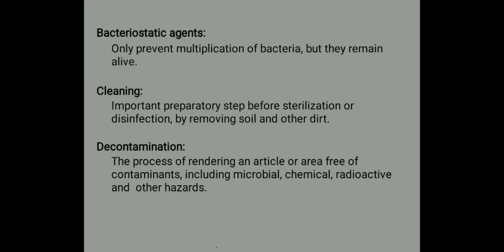Talking about cleaning, it is an important preparatory step before sterilization or disinfection, removing soil and other dirt. Decontamination is the process of rendering an article or area free of contaminants including microbial, chemical, radioactive and other hazards.